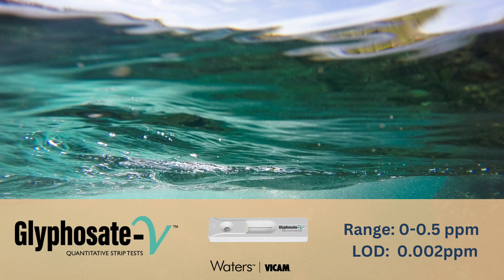BICAM's Glyphosate V Lateral Flow Strip Test measures total glyphosate concentrations in water and cereal grain samples in less than 15 minutes. The test is designed for field and laboratory use and requires no special training or expertise to obtain accurate, precise results. In this video, we'll demonstrate the quantitative Glyphosate V method for water samples.